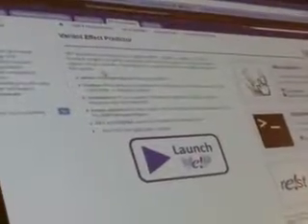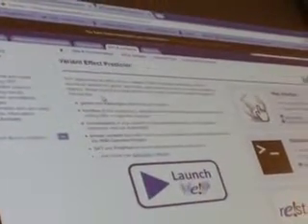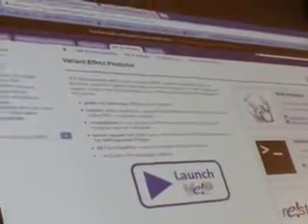this tool set, the Variant Effect Predictor. This is a pretty good tool set that has a web interface, so you can put a file up on the web, but I don't know what its file restrictions are, how big of a file you can load in it. But you do have a standalone script that you can install on your local Unix machine and then call out to Ensembl and pull the information back. And what it does is what I just showed you. It annotates that VCF file with the name of the gene and so forth and the location and all of that.